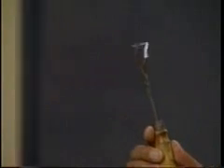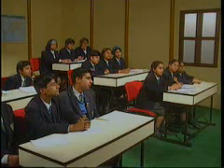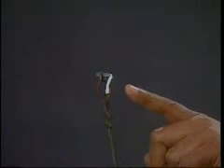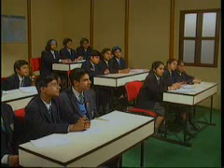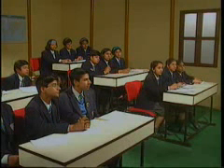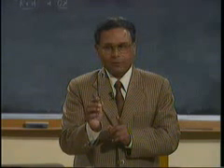And now, after the burning, do you find the change? Yes, sir. This is the original magnesium ribbon. Yes. What's the color? Gray. And after the burning, the color is white. Can you say these two are the same materials now? No, sir. That means some change has taken place. What type of change? Sir, physical change.